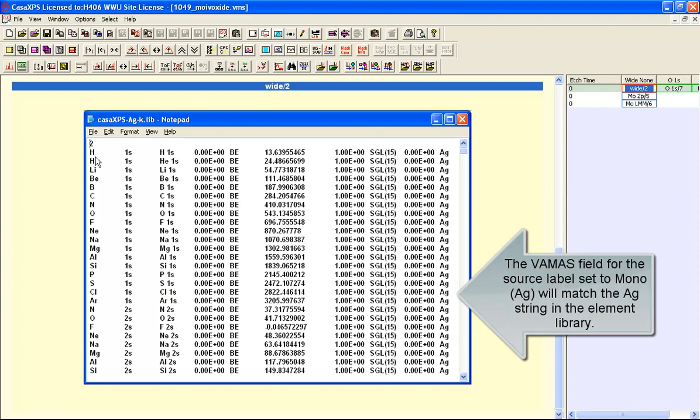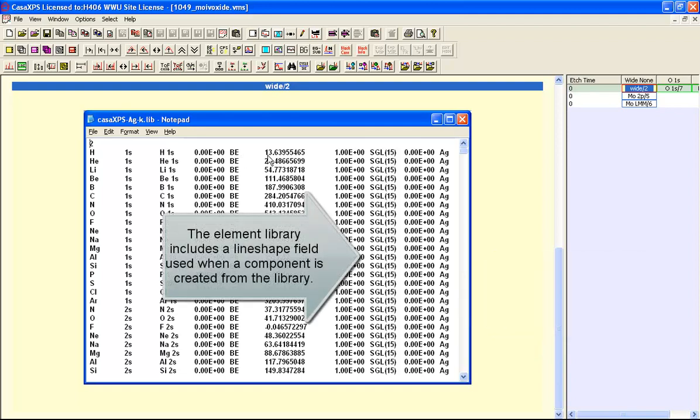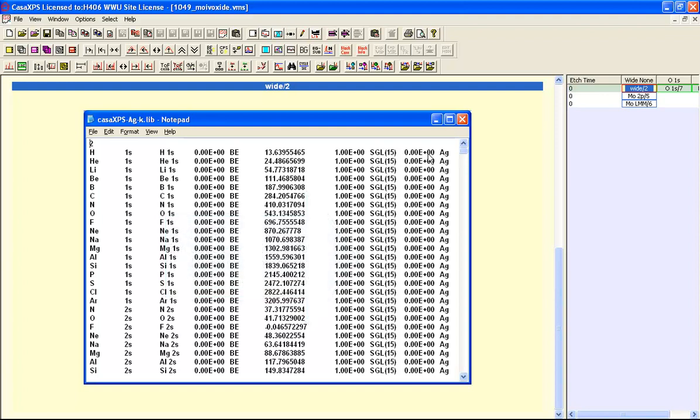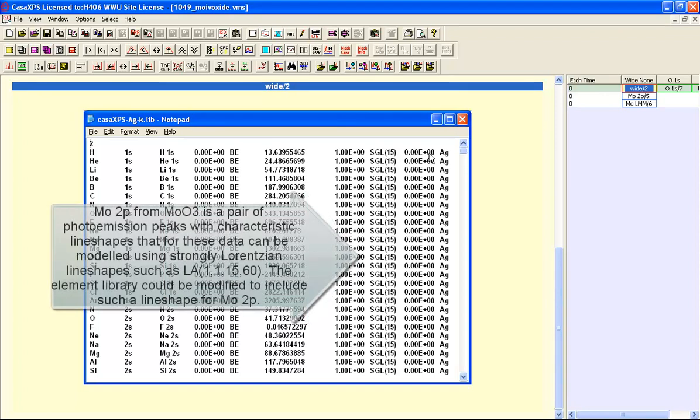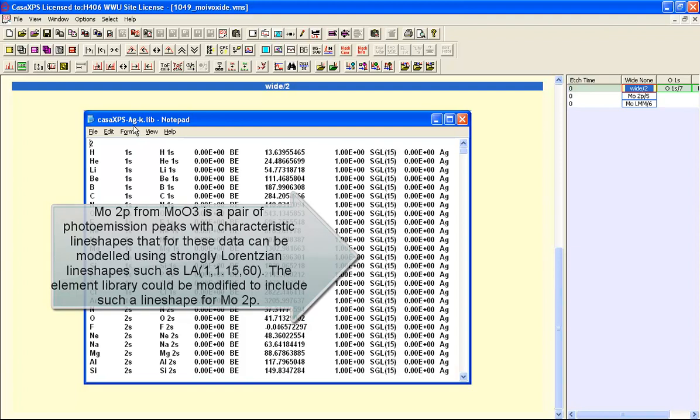You have a name, the element transition. You've got the binding energy indicating it's a photoemission line and the binding energy for that photoemission line. We also have a line shape and finally there's the relative sensitivity factor which is set to zero, and the source label which is Ag, which makes this a library that is associated with the silver anode.